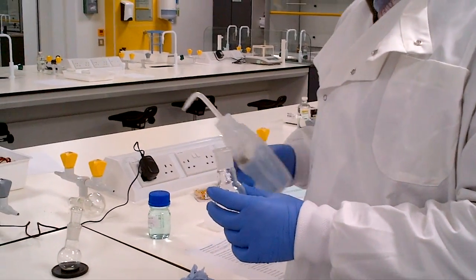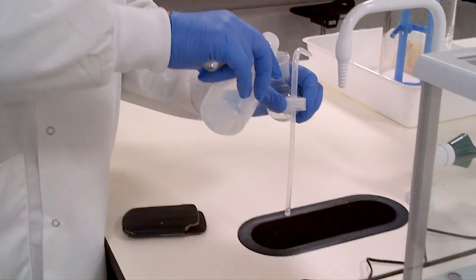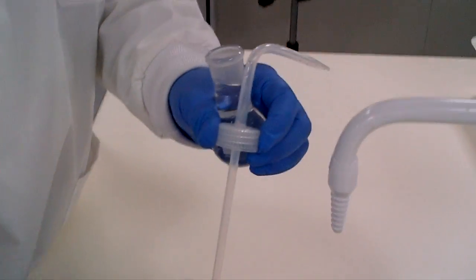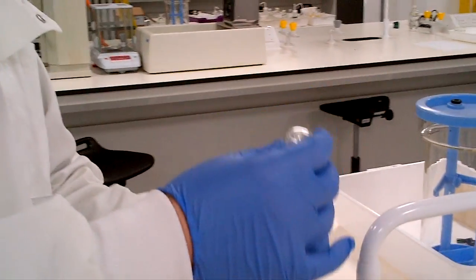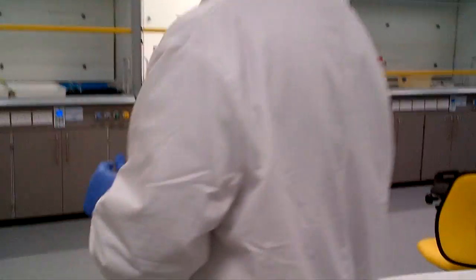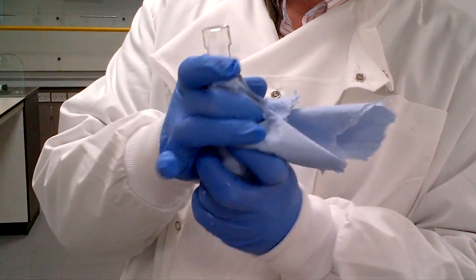either fill up at this point with the water bottle or go towards one of the sink bases. We'll just take the top off the water bottle, drizzle our water in, and fill towards the top. Should you have an air bubble in the flask, sometimes it's better to flick it out with your finger. Then you put the stopper down, secure it, and you'll notice that the flask is wet. I've got my gloves on because you're going to see something in a moment about how to clean the flask afterwards. Again, get some more tissue paper and make sure that the outside of the flask is dry.